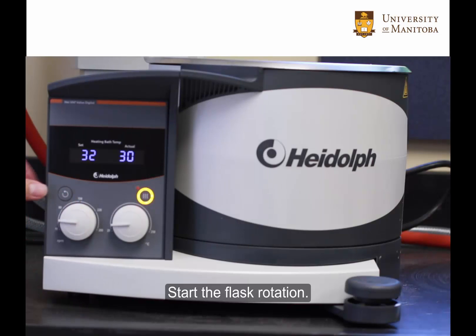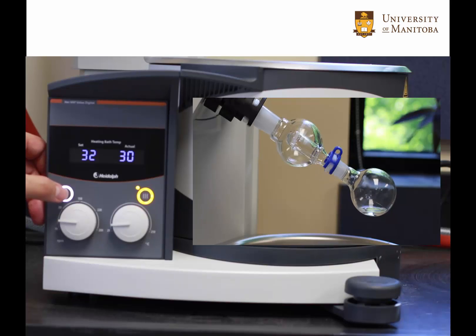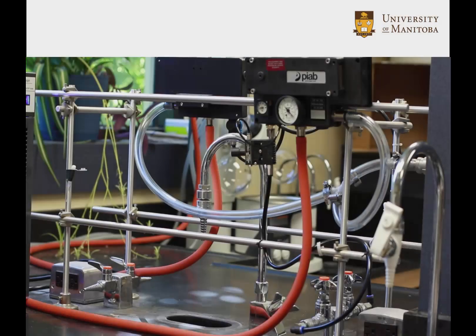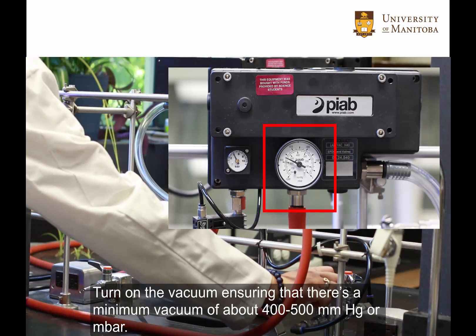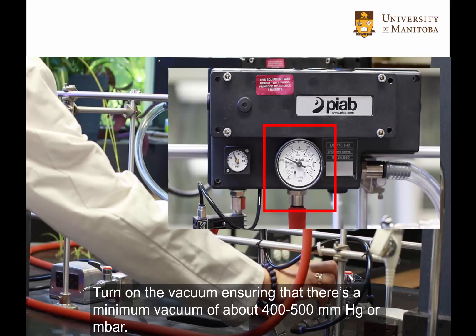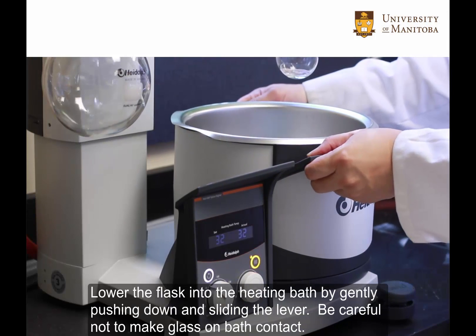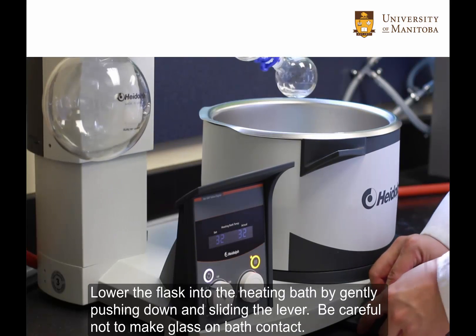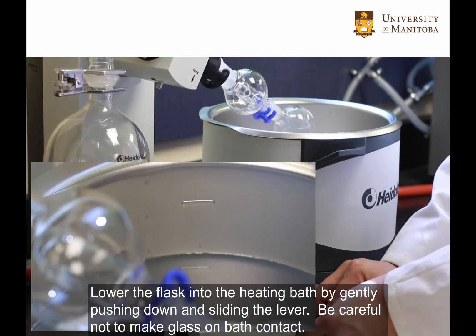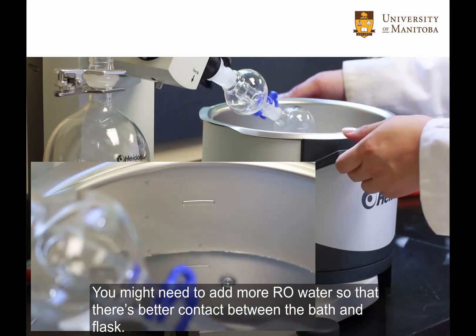Start the flask rotation. Turn on the vacuum, ensuring that there is a minimum vacuum of about 400 to 500 millimetres of mercury or millibars. Lower the flask into the heating bath by gently pushing down and sliding the lever. Be careful not to make glass-to-bath contact. You may need to add more reverse osmosis water so that there is better contact between the bath and flask.